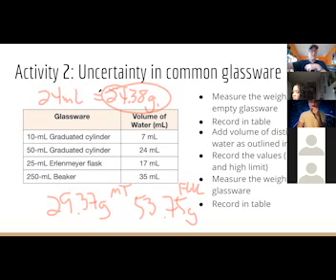And even with the ridiculous task of trying to measure 17 mils in a flask, well, at least we have something that's smaller than 17 and something that's bigger than 17. However, now we have no way of knowing whether we've gone over a particular number or not. All we're going to know is that it's less than 50. That's it. That's all we're going to know.